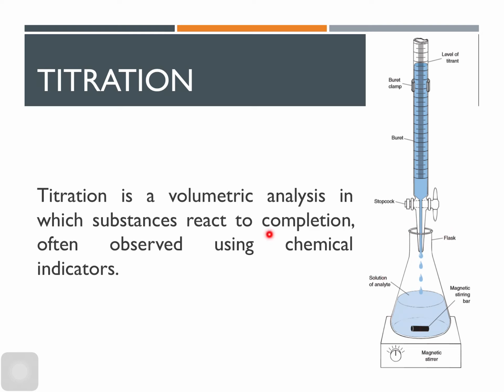to complete the reaction. So I'm going to have my substance here, another substance here. Then I'm going to add this substance into this flask. Then I'll see until I can say that the reaction is complete. This is usually observed using chemical indicators.